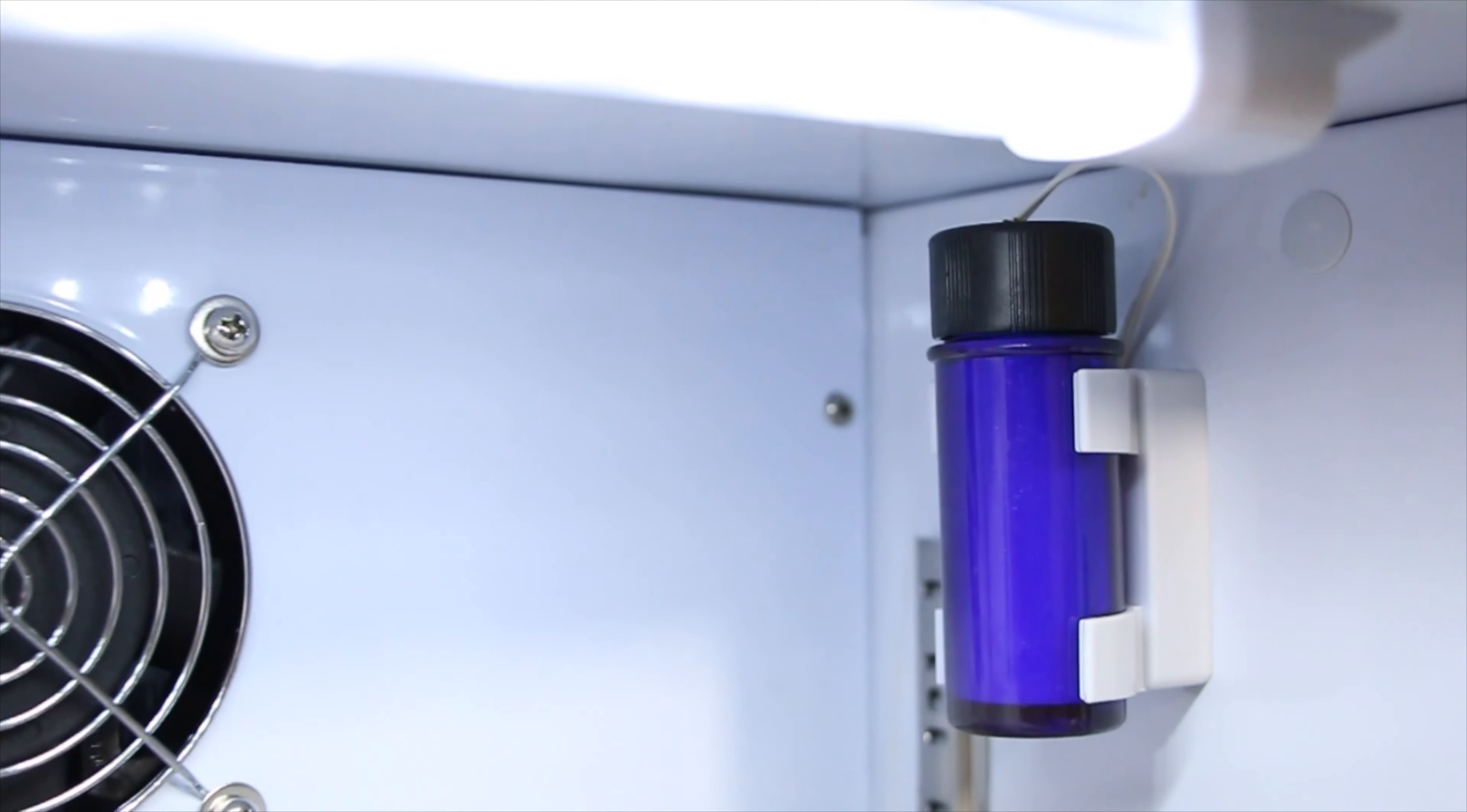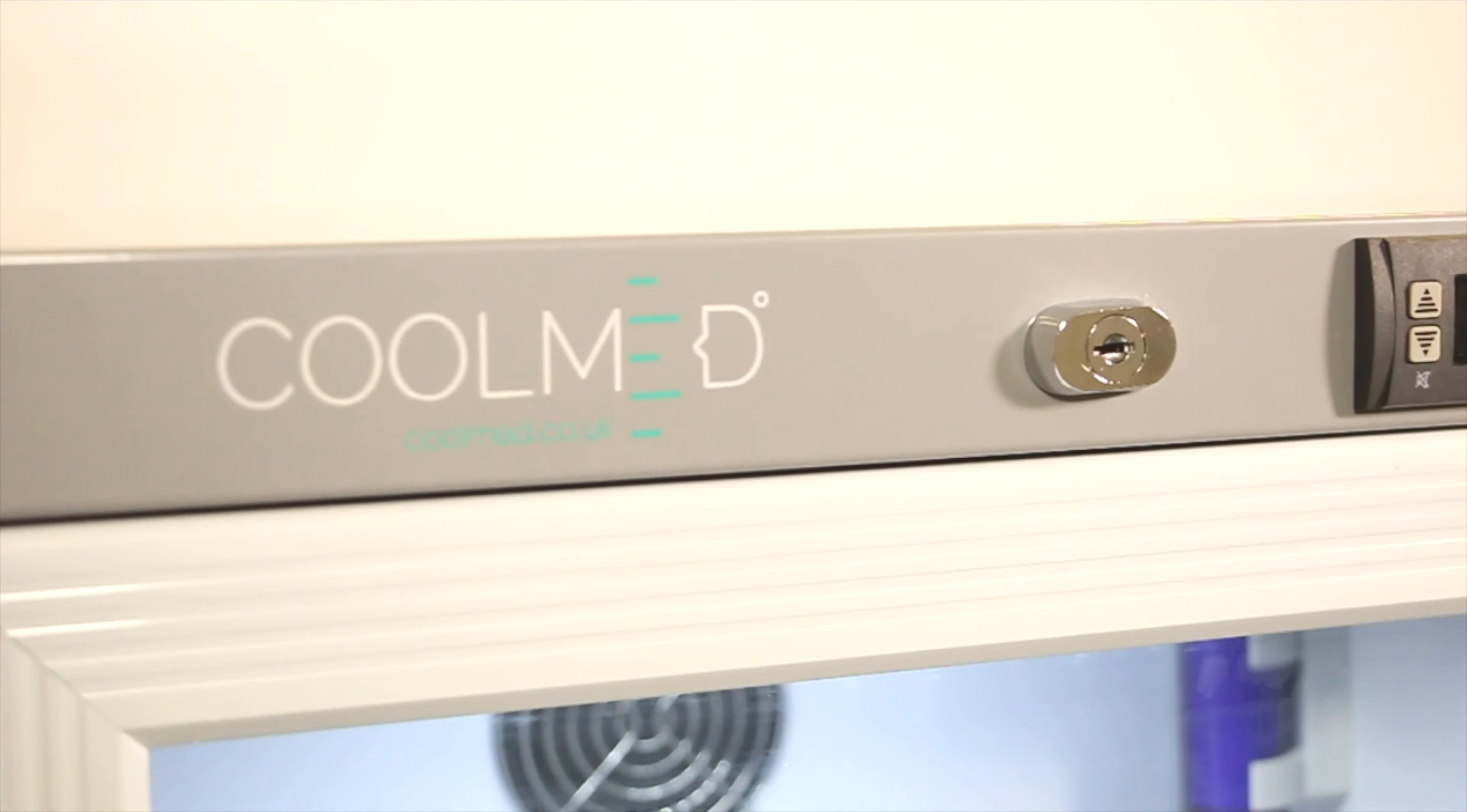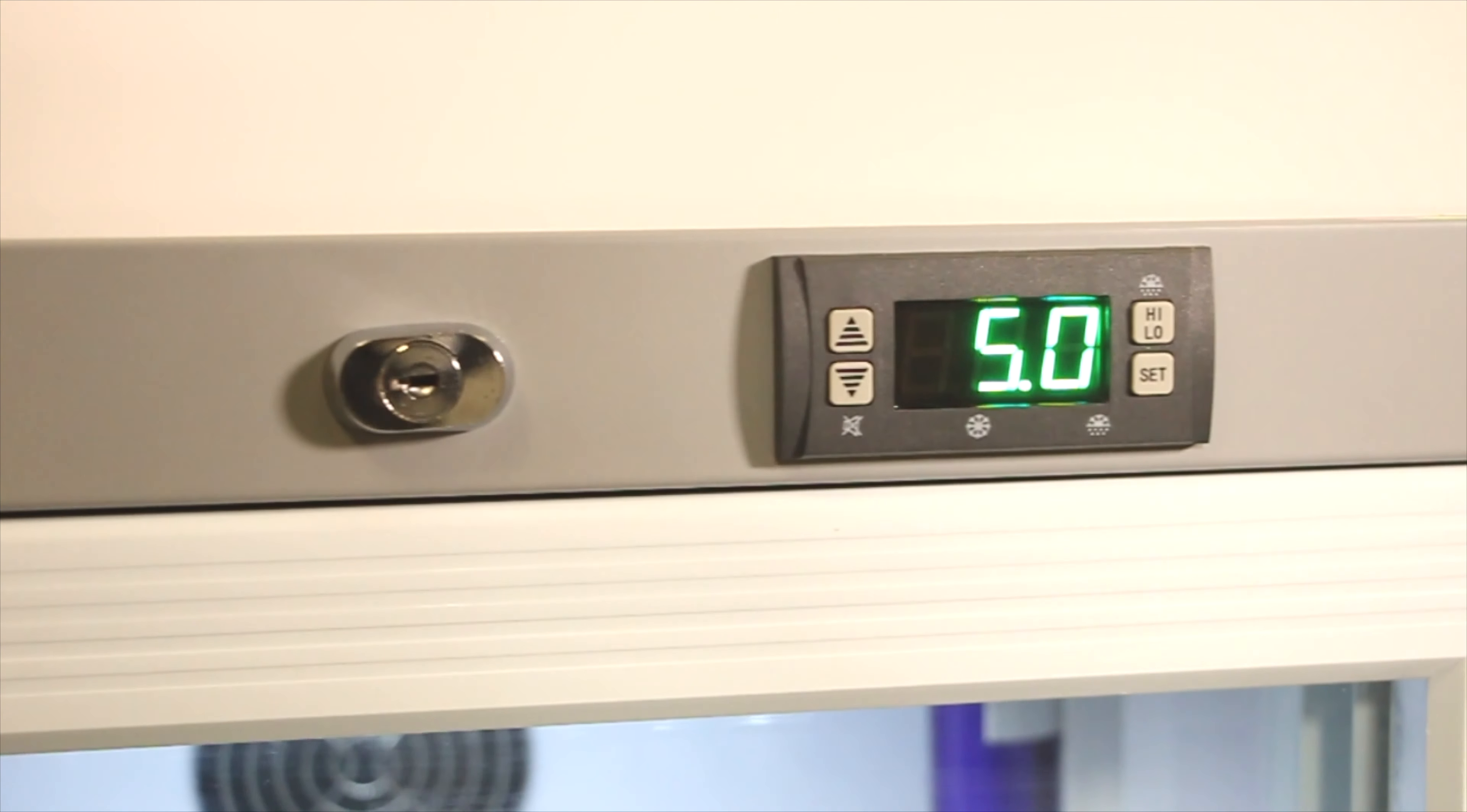This fridge features a built-in temperature probe which accurately monitors and stabilizes drug temperatures. The temperature of this fridge is factory set between 2 and 8 degrees. You can then set the temperature between these points using the controller. The fridge will be preset at 5 degrees.